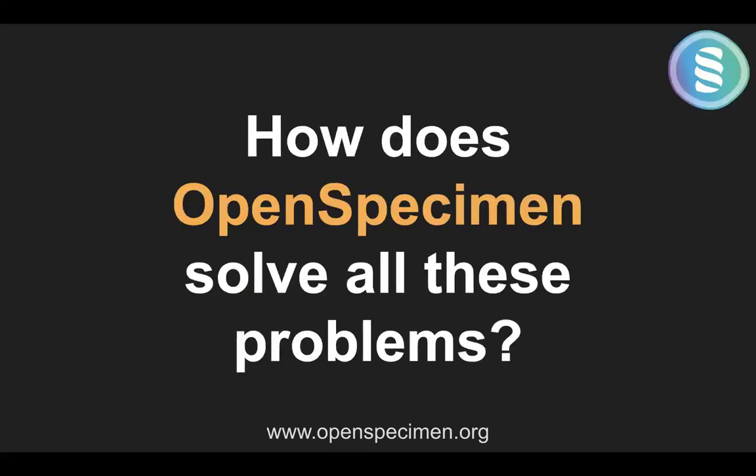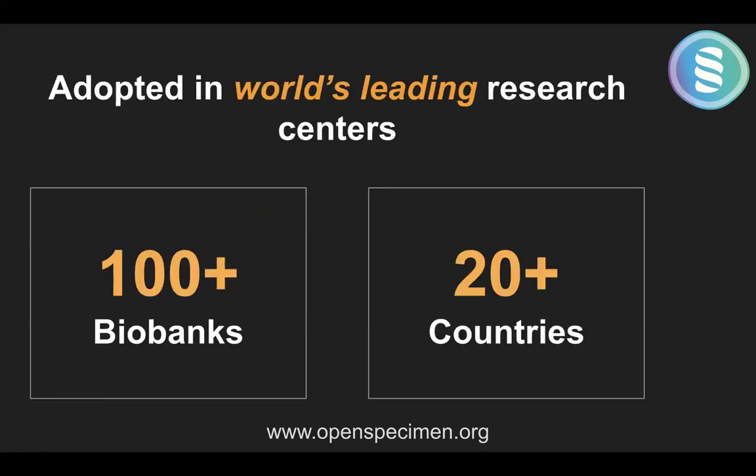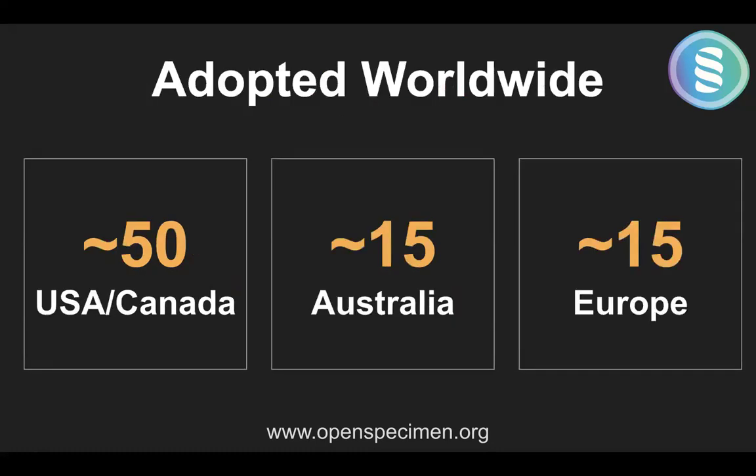Now let's look at how OpenSpecimen solves these kinds of problems. First, about us, we have about 15, 16 years of experience working solely with biobanks across the globe, and our experience and expertise all lie around this domain. We today work with about 100 plus research centers across 20 plus countries. And again, solely in this field. It's not like a generic lab or generic LIMS system that can be used across, like a water testing lab or a cannabis testing lab, etc.